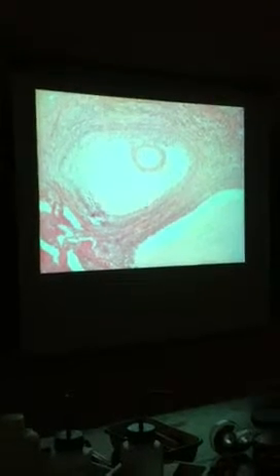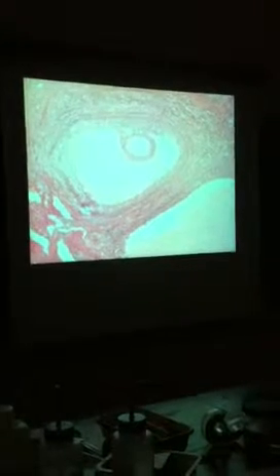So again, that entire thing at the end of the pointer would be the Graafian follicle. The space would be the antrum. Cumulus oophorus, that little section at the top. Corona radiata, then the zona pellucida, then the oocyte. It's huge.